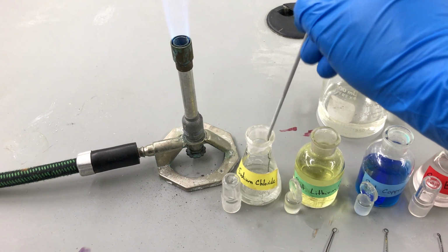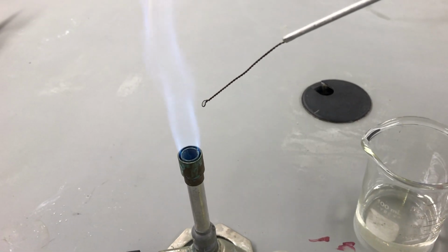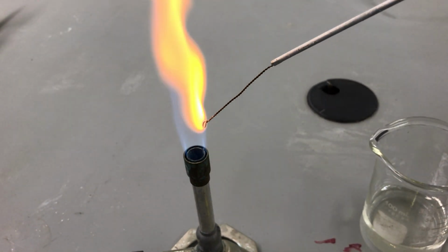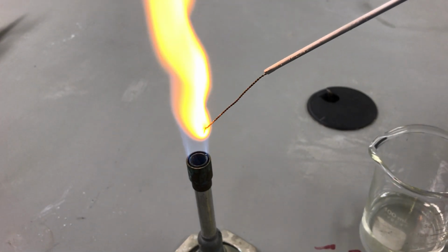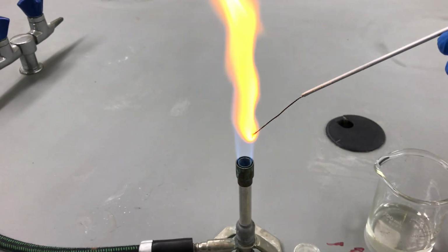Alright, so once our loop is decontaminated, we dip it into our known sample. This time we're doing sodium chloride. And then we reintroduce it to the flame. You want to do it kind of at the edge so you can get a good idea of the color. And as you can see, it turns this beautiful kind of orangish yellow. So kind of yellowish orange, very bright. And you might actually recognize that color from somewhere.